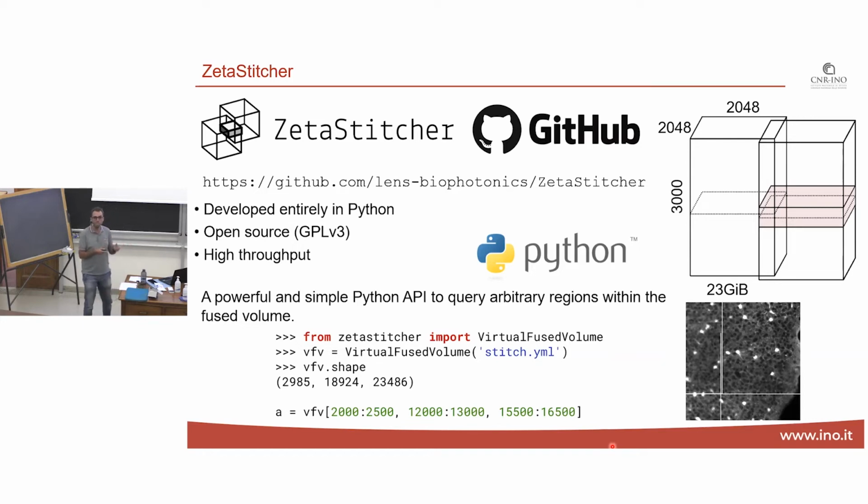It's very convenient, especially if you want to feed a data set that is this big to, for example, an artificial neural network. Of course, you have to feed it in chunks, in small chunks. And you see that we can actually see the individual neurons. These are the cell bodies of individual neurons.